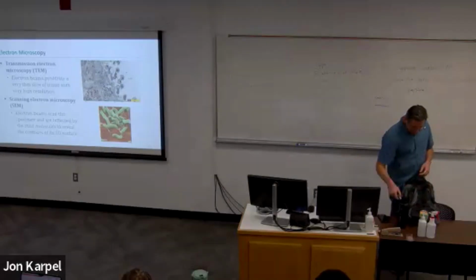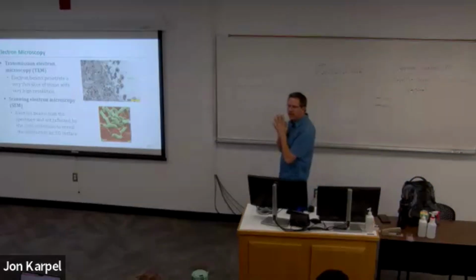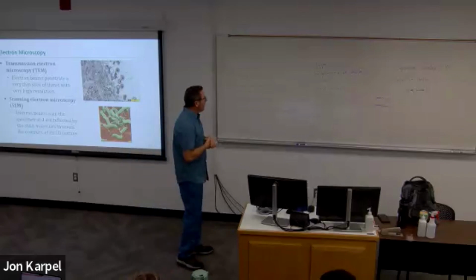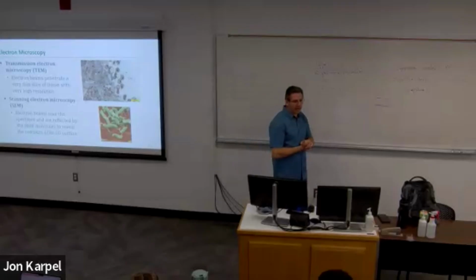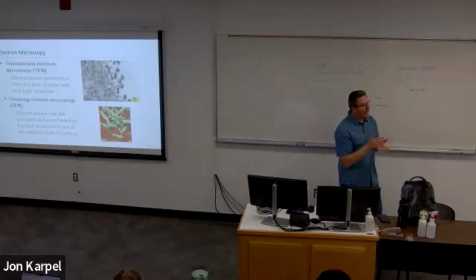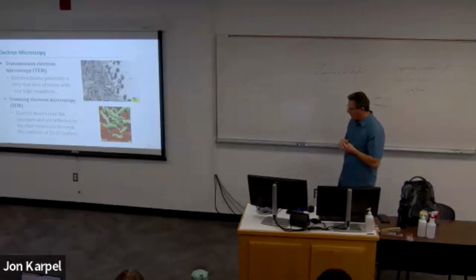Okay, so any questions on today's material? In terms of expectations, I tried to give you some hints about what I care about and what I don't care about. Can you just say again which types you want us to focus on most? Well, probably bright field and dark field. Bright field is the only one we're going to use in lab. It's very easy to use and very useful for bacterial types. But it does have some drawbacks.